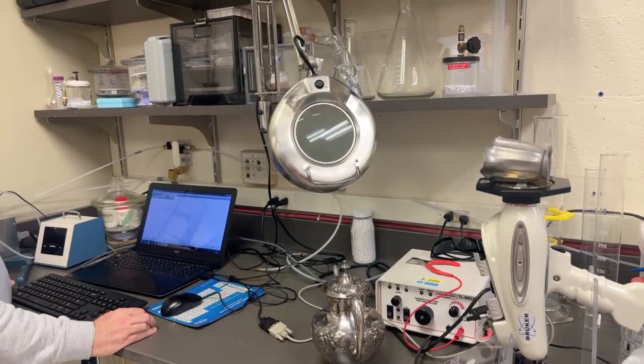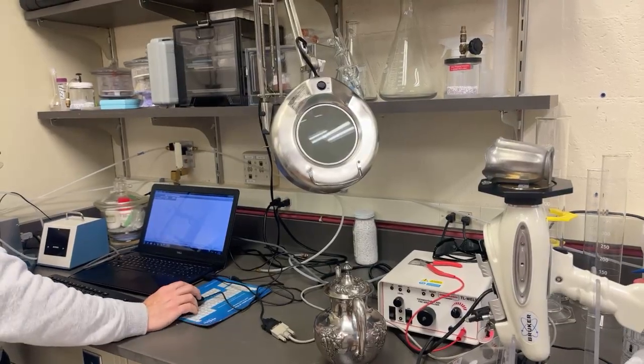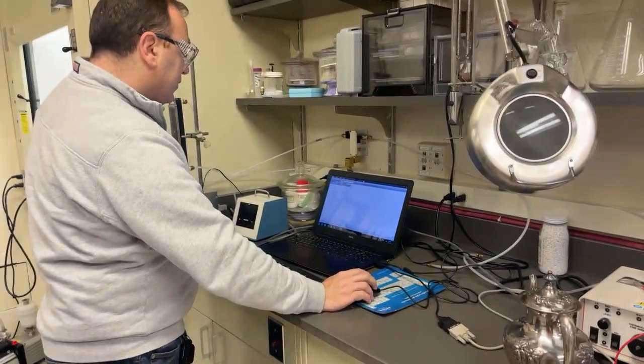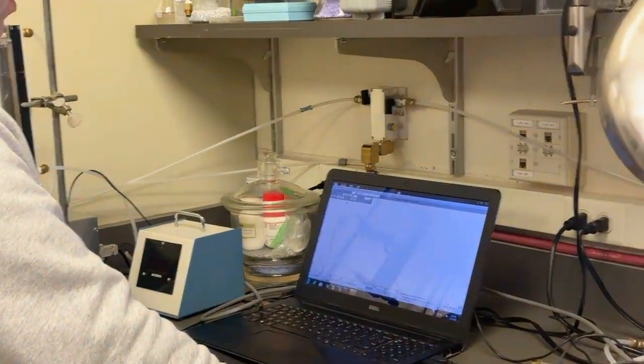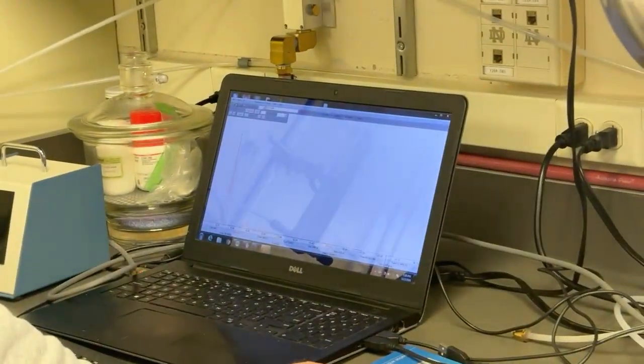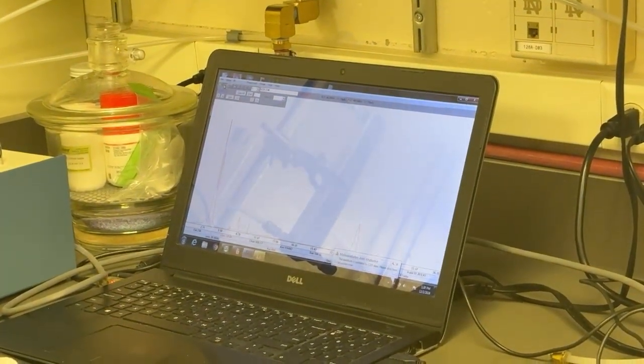And then we already see we can go a little longer to build a better signal and to have enough statistics. After some minutes, you can do longer, but I think 10 seconds is enough even now. I don't see it changing anymore, so I think we've got our answer.